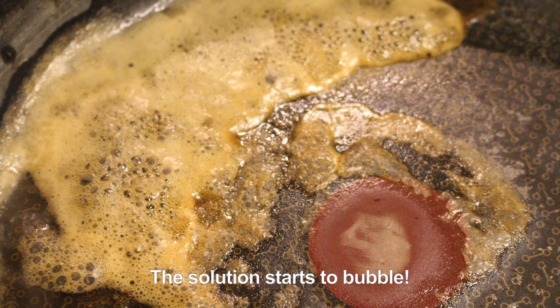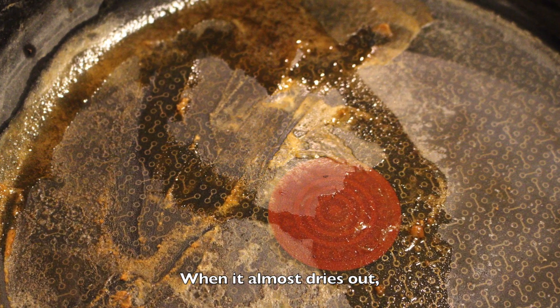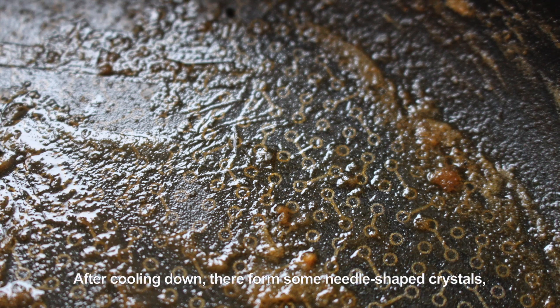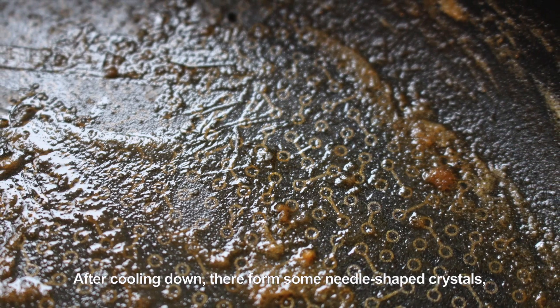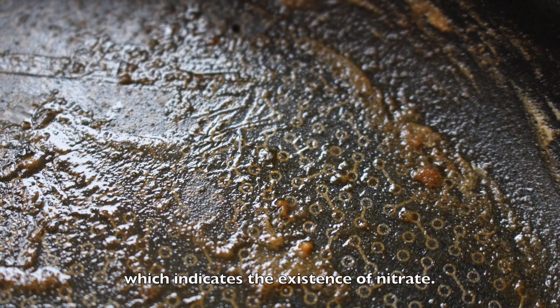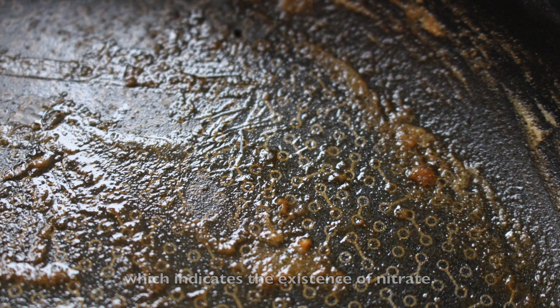The solution starts to bubble. When it almost dries out, I add some water to re-dissolve the residue. After cooling down, there form some needle-shaped crystals, which indicates the existence of nitrate.